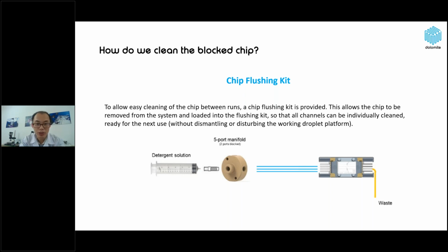Okay, I got one question from Mr. Huang Kanrui. So if reverse washing doesn't work, what should we do? Actually, we need to repeat reverse washing with a different flow rate or different pressure applied, that should be lower than the limitation of the pressure.